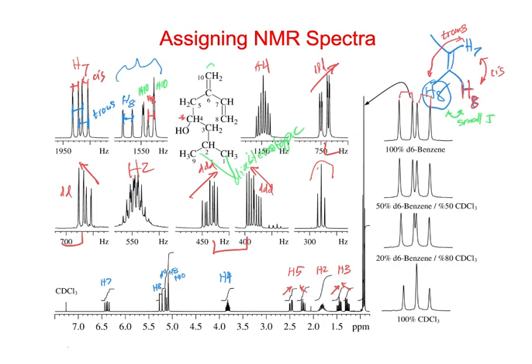Well, I think in 100% benzene, we have two doublets like this, right? And as it goes to chloroform, those two are moving together until the middle one is overlapping. And that's why it shows up as a 1 to 2 to 1 ratio, because the middle peak of both of those doublets is overlapping right there. Yeah, but you could do the same. You would get the same thing if you just moved it like that.